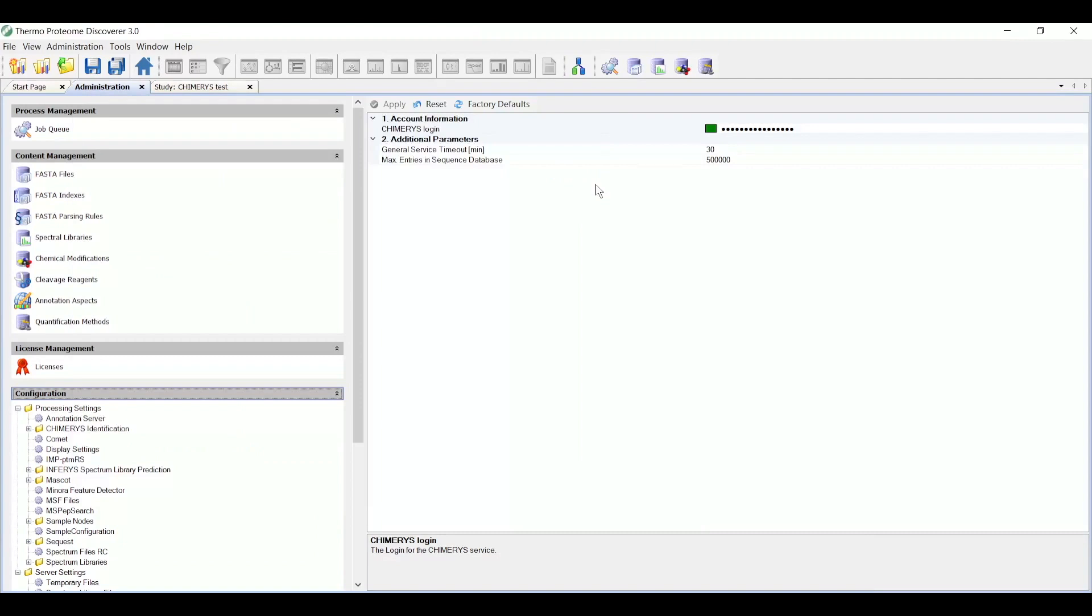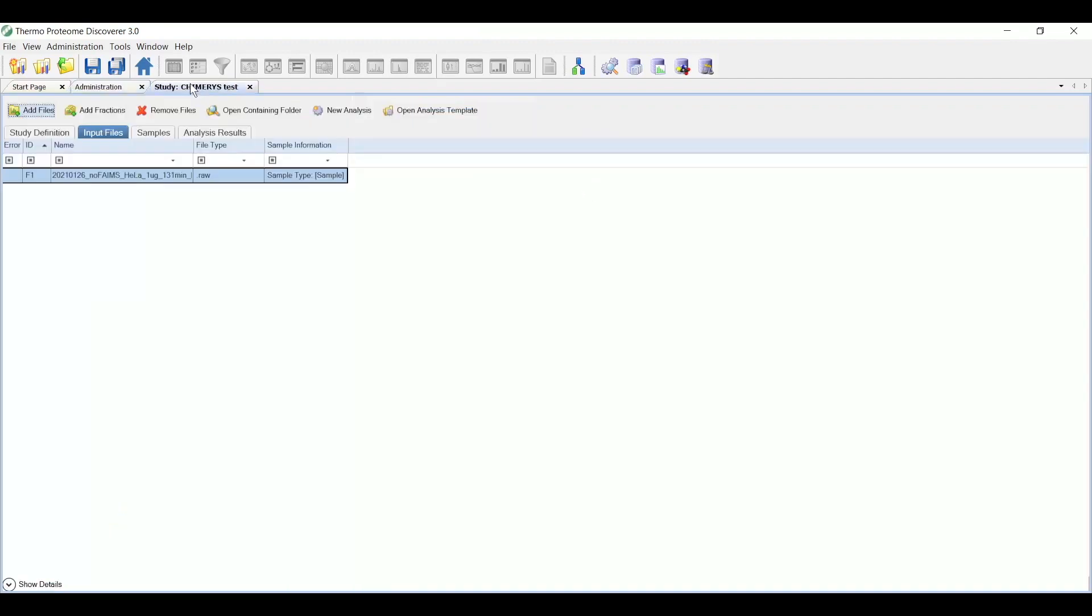Now that we've verified that we are connected to the service, we can go ahead and create a study or open an existing study, create the workflows for the CHIMERYS search, and then view the results. So I've already created a study here called CHIMERYS test and imported a data file for which I want to search.